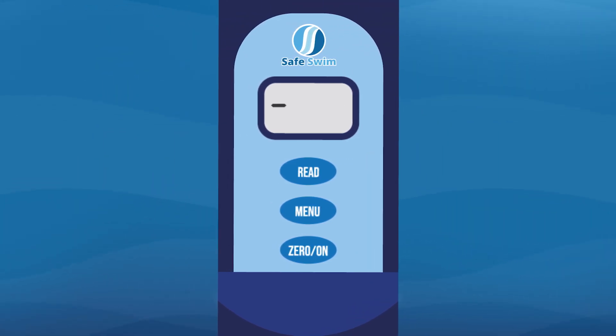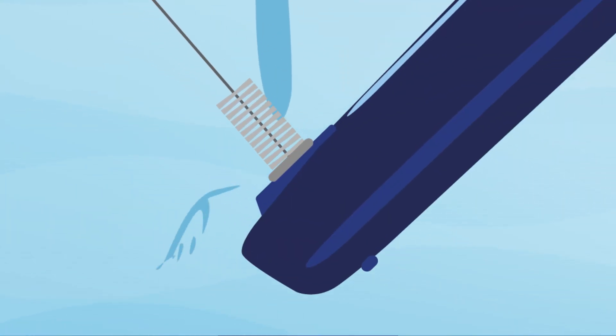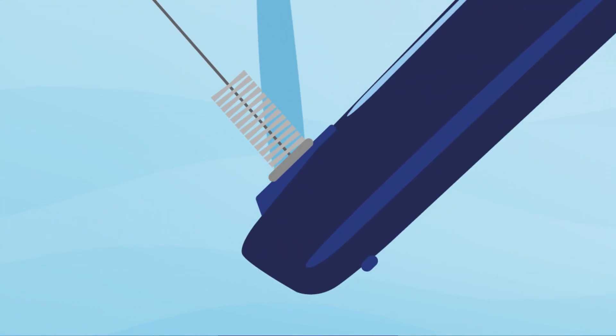The result for the pH test will be displayed momentarily. This result is automatically stored in the meter's memory. If the result reads low, that means the pH is below 6.4. Testing is now complete — rinse the cell out with water and clean it once again using the brush.